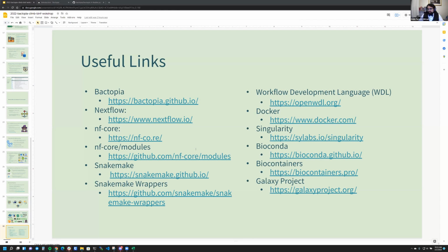Yeah, and also admittedly, I do flag all of Rob's modules. If he has it, I first copy paste that, and then I go and mush it up to do whatever I want for workflows I'm working on as well. So just that resource is there. There's a few questions coming in on Bactopia. Does Bactopia work for metagenomes, or does it only work on a few species or genera?